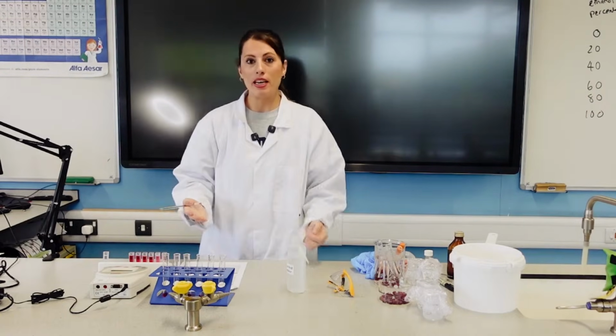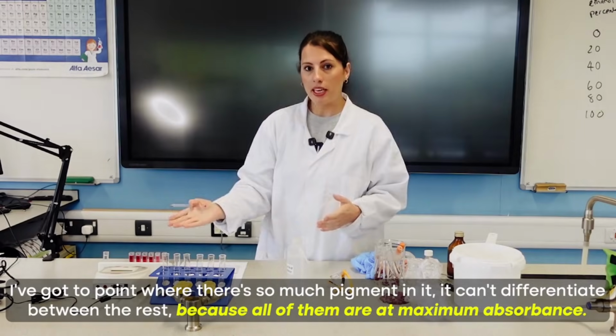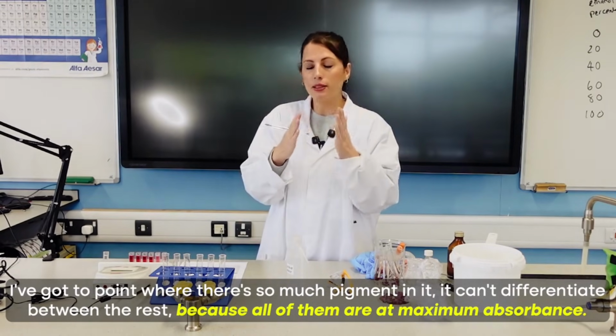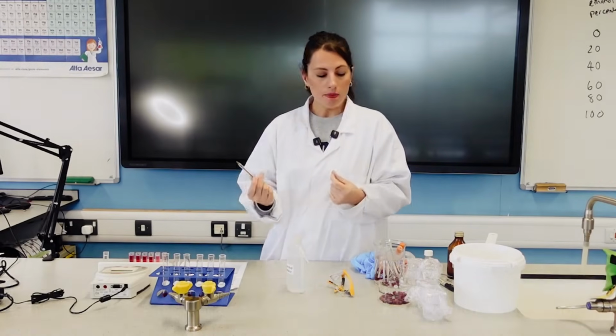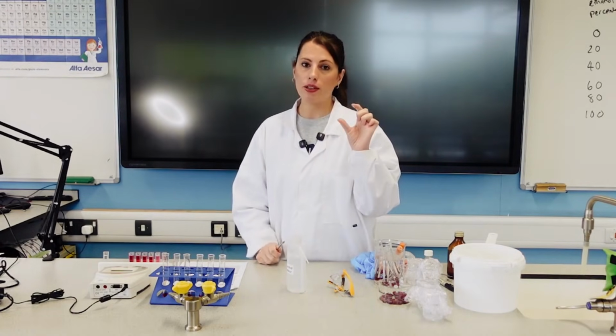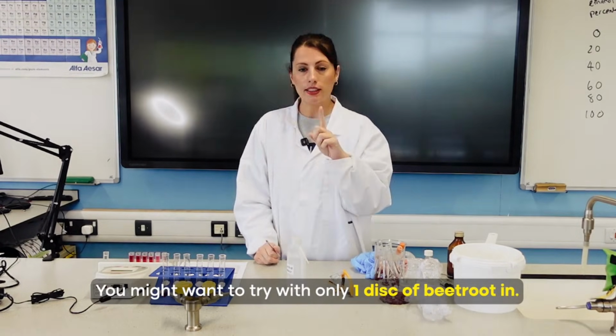So essentially what this means is I've got to the point where there's so much pigment in it, it can't differentiate between the rest because all of them are at maximum absorbance. So there are different ways to overcome this. I actually put 3 discs of beetroot in, so you might want to try it with only 1 disc of beetroot.